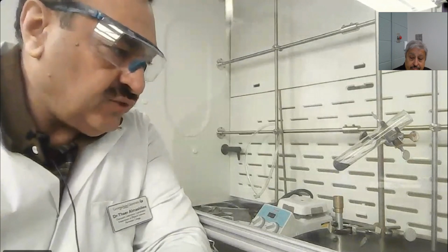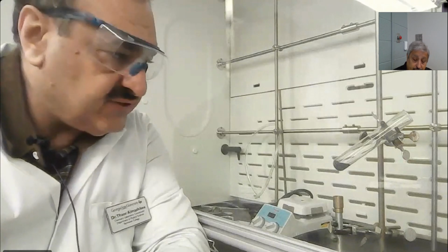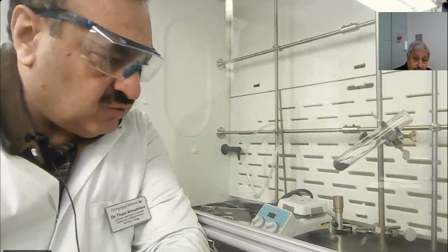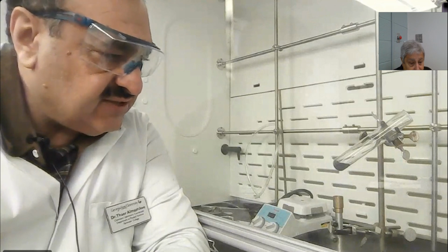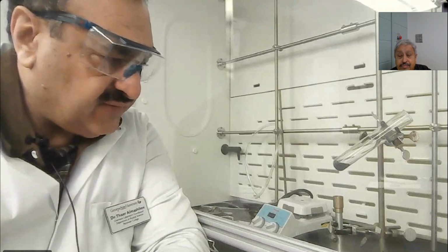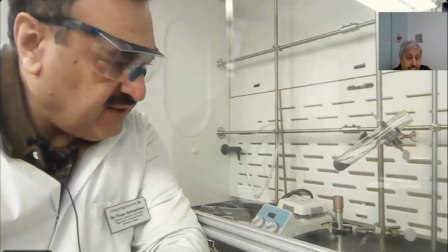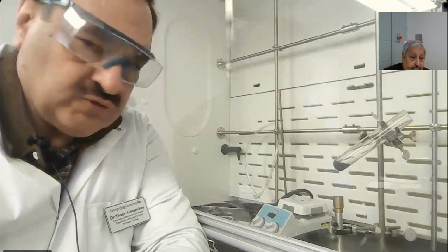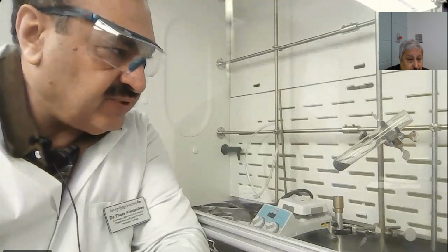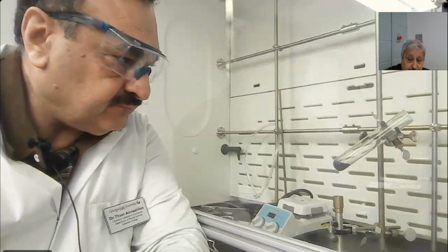After that, we need to heat up the test tube again for another 8 minutes, wait for it to cool down, and take the mass again and see the difference between the first one and the second one. If the difference between these two runs is within 0.05, then you are good. You don't need to do the third run. If it's not, you have to heat up your test tube for the third.